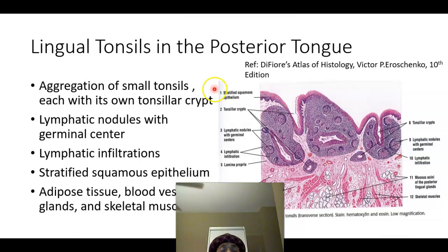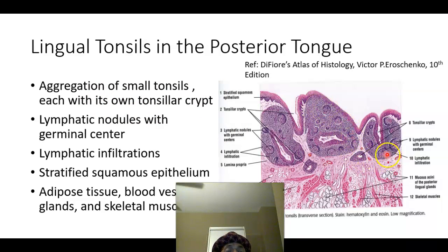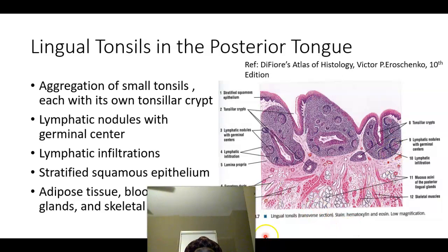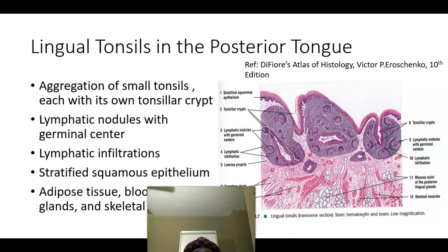In the posterior part of the tongue we find the lingual tonsil — these are aggregations of lymphatic nodules. Some of the nodules may have germinal centers, which are areas where many lymphocytes develop, appearing as light-colored zones in histology. In the posterior one-third we also find adipose tissue and mucus-secreting glands. The skeletal muscle fibers are distributed haphazardly.